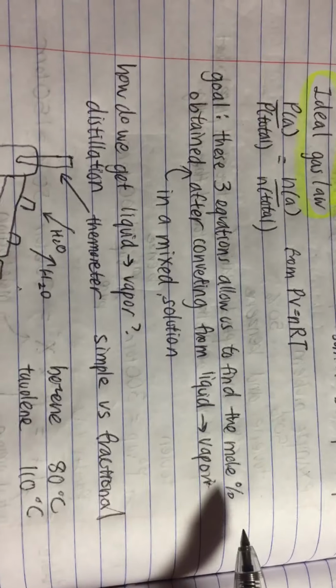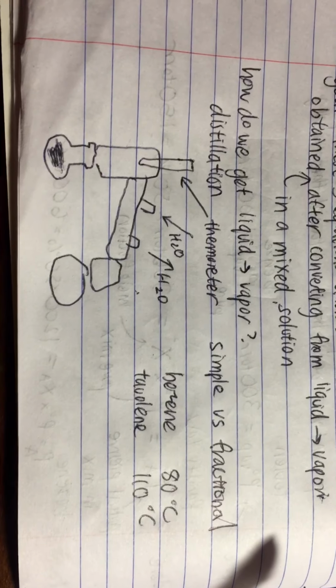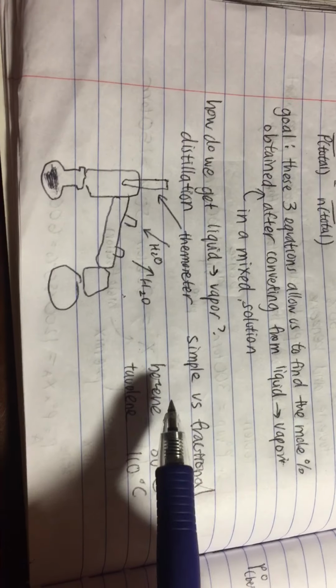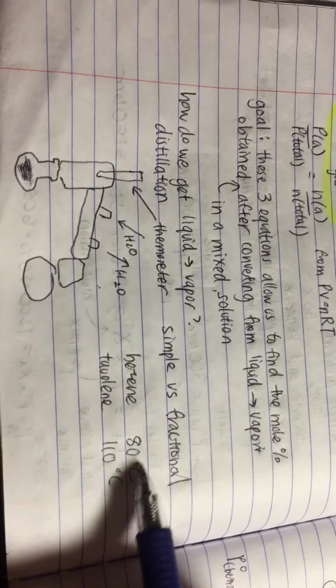from converting the liquid to the vapor. So how do we get from liquid to vapor? We use a technique called distillation, and pretty much how it works is you're going to have two liquids, they're miscible, so it's a homogeneous mixture. Let's say it's benzene and toluene, and they both have different boiling points.